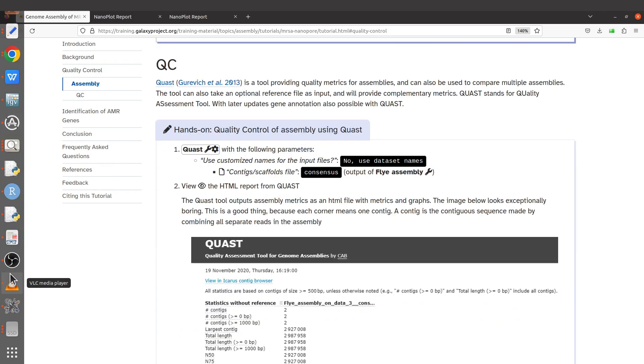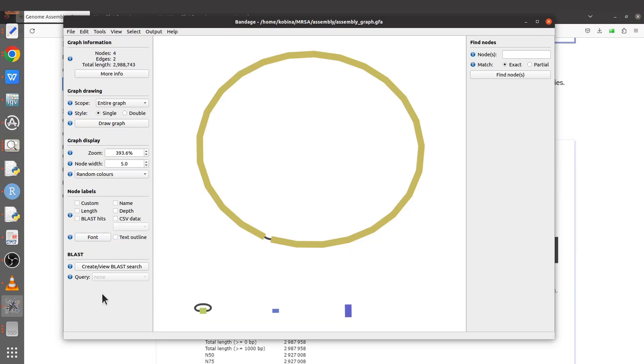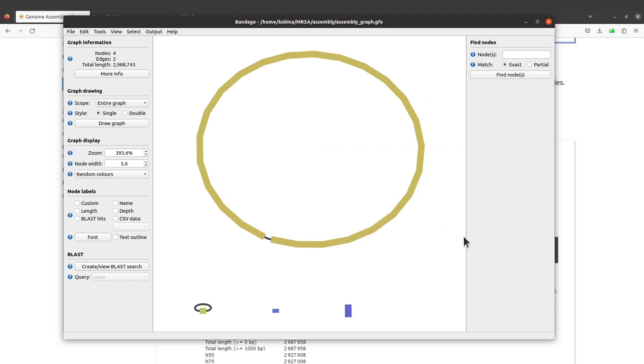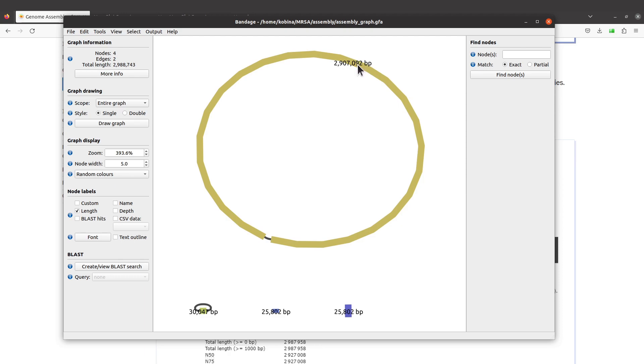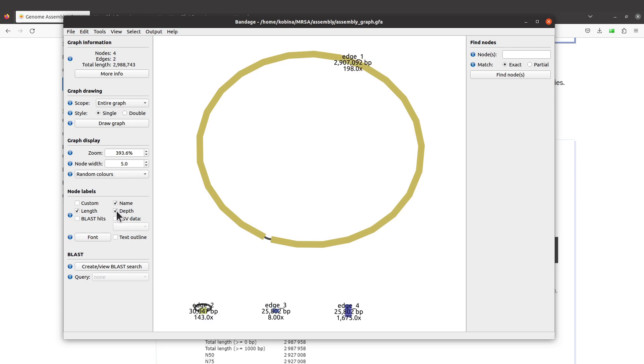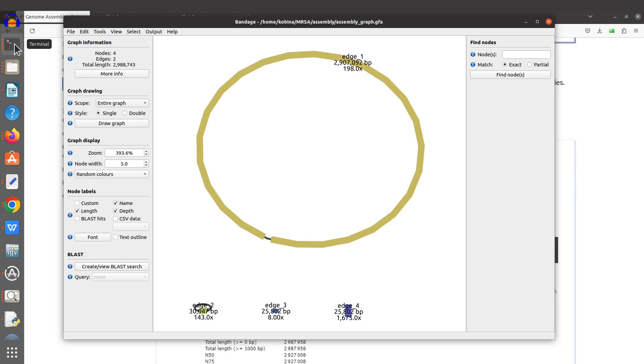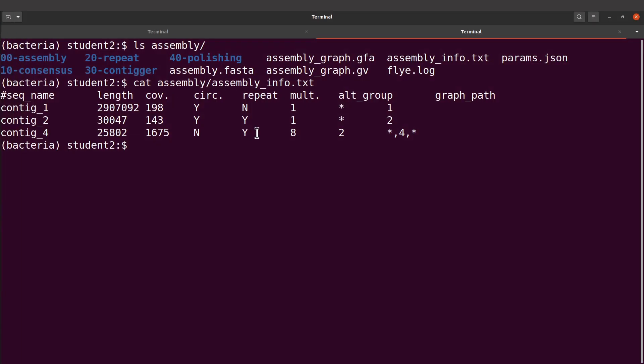Now with the assembly graph that you have, if you display it, it's possible to annotate. You can add your length. When you check it, you will see this one as 2.9 Mb. You can add a name. You can also add your coverage. Remember we had 198 on the table. That is what has been displayed here. That's for the depths.